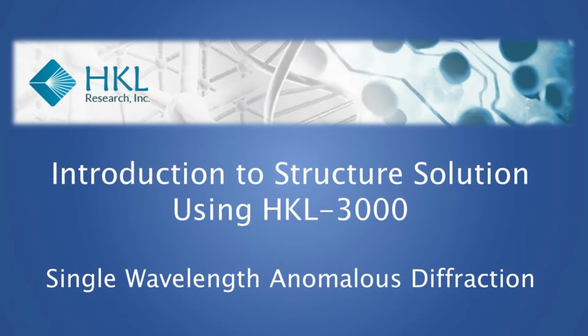Welcome to HKL Research's Introduction to Structure Solution using HKL 3000. This video focuses on structure solution using single wavelength anomalous, or SAD, diffraction data.